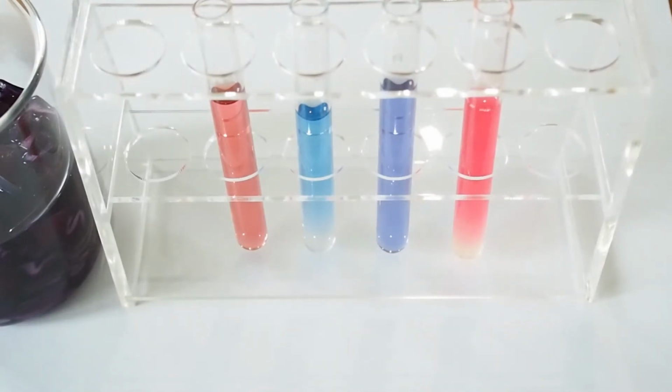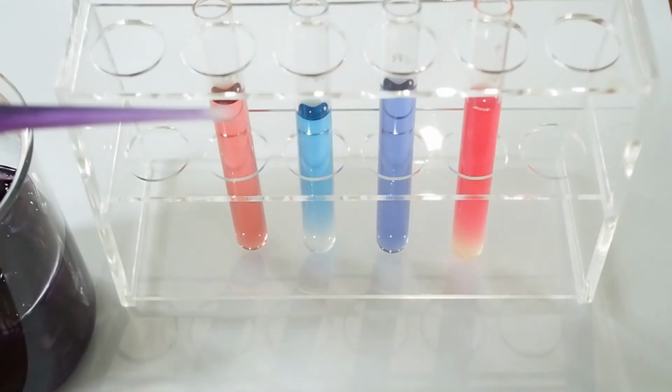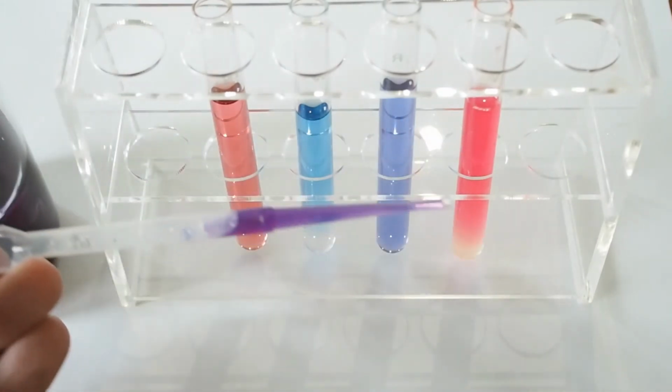And that's a really important thing to realise, is we're not seeing the acids or the bases here. We're seeing the indicator change colour, which is telling us or indicating to us that there's an acid or a base present. And that's just a subtle difference. This is such an easy indicator to make, and we can do so many experiments with it.